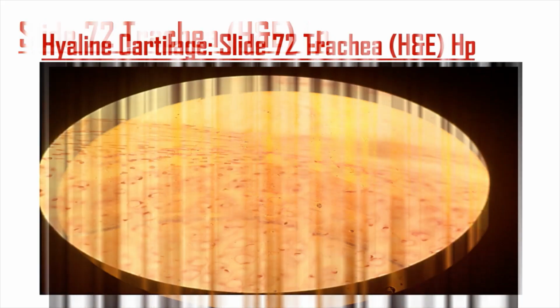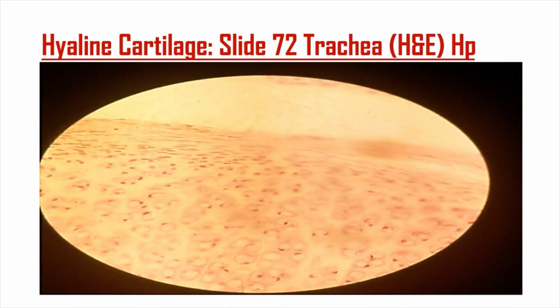And then this is at high power cartilage. So as you can see, this is the perichondrium. The perichondrium is connective tissue, meaning that in it you have collagen fibers, mostly type 1 collagen fibers, and you've got cells called fibroblasts.